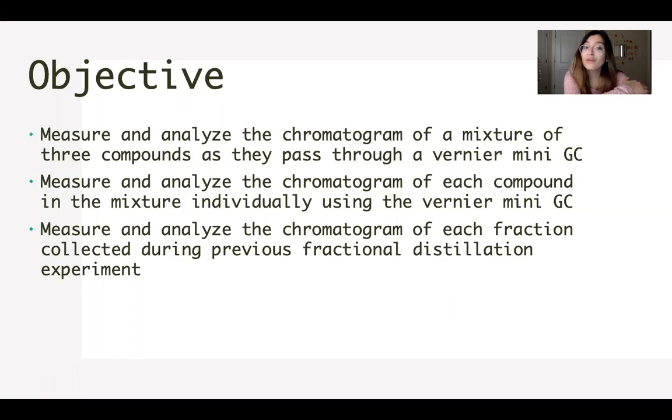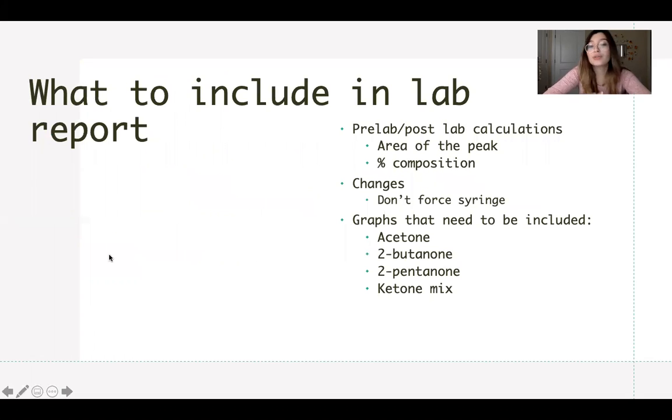But given COVID and that we're doing a lab in person and a lab online, that is not going to happen. Instead, you will be doing this step right here during fractional distillation when you come into lab, okay? So if you want to add a change, we're not going to be doing this part. Okay. What to include in the lab report.